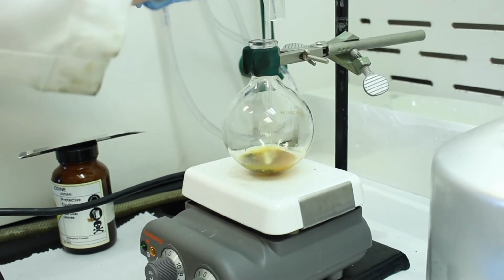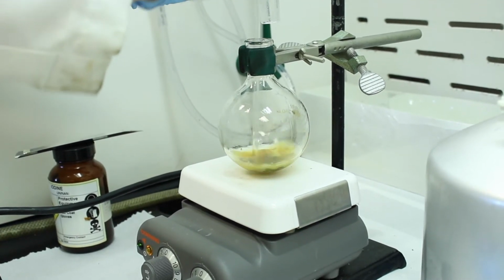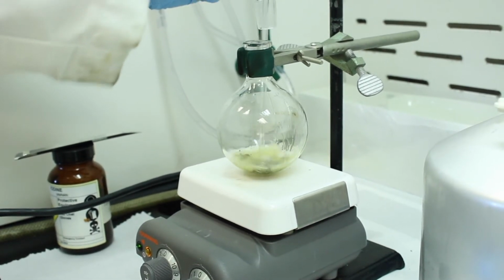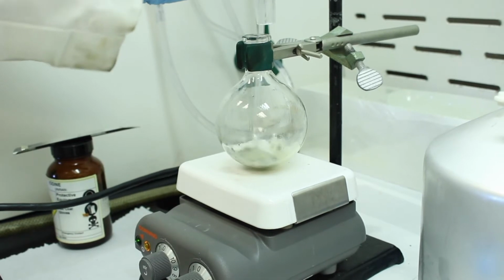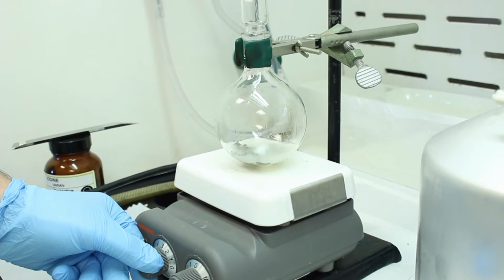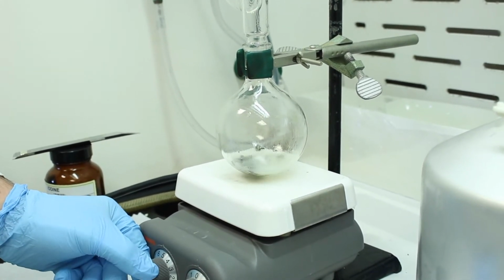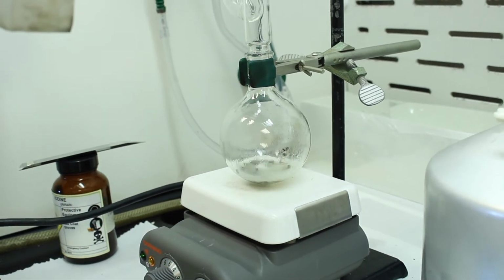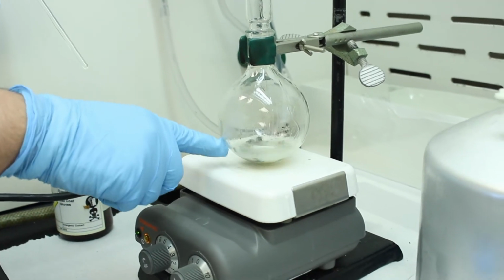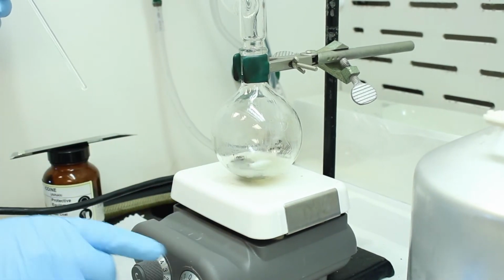Okay, seems like we might be getting something here. There you go, you can see it lightening in color. Nice, okay. There we go. I think we've started here. Yep, so you can see the solution is becoming slightly turbid. Okay, so this should be sufficient here. The magnesium should begin to react.